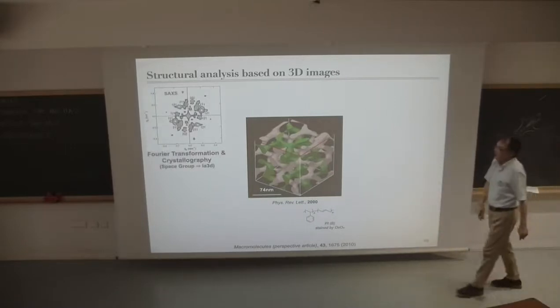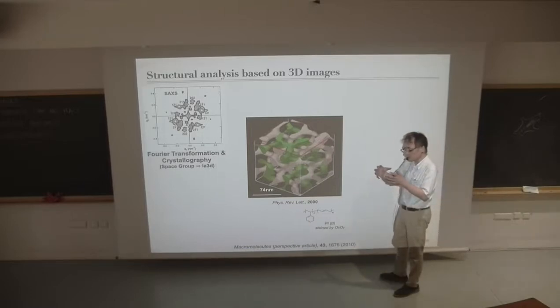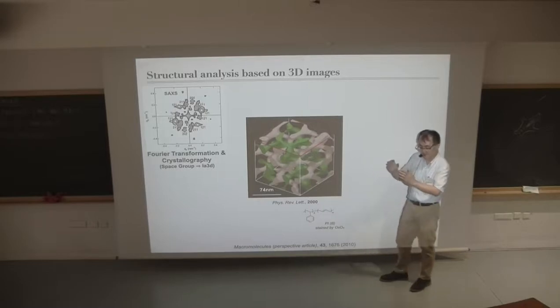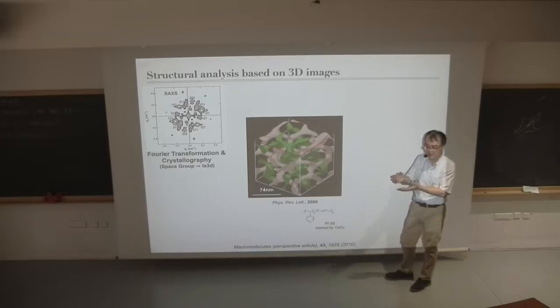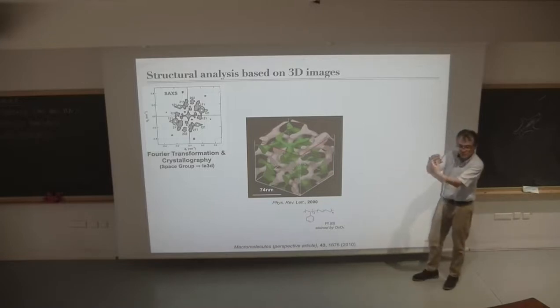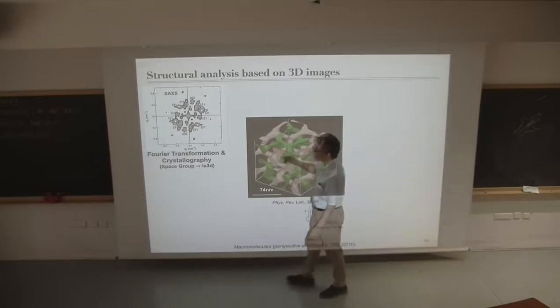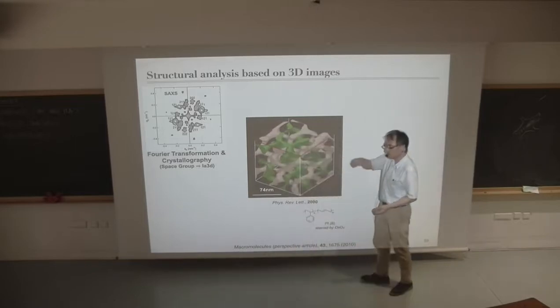What we can do is take a single grain and do a sort of pseudo scattering experiment. This kind of sample is multi-grain, and when you do scattering, the beam size is typically on the order of a millimeter in the lab, and even at a facility it's micron size. So there are lots of grains inside the beam. Then the scattering pattern from that kind of experiment will be circular.